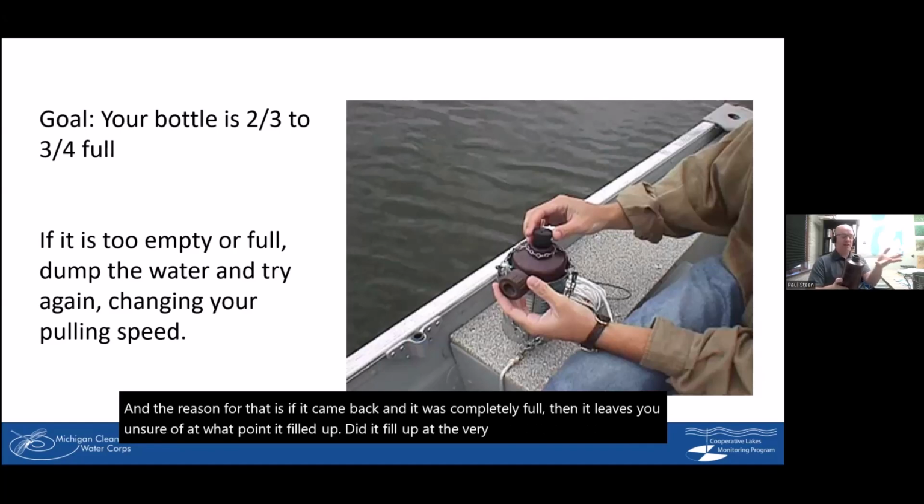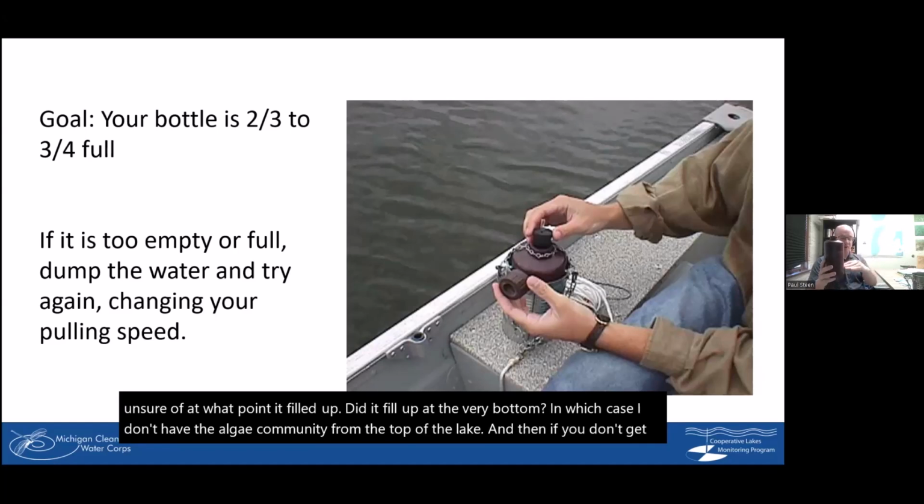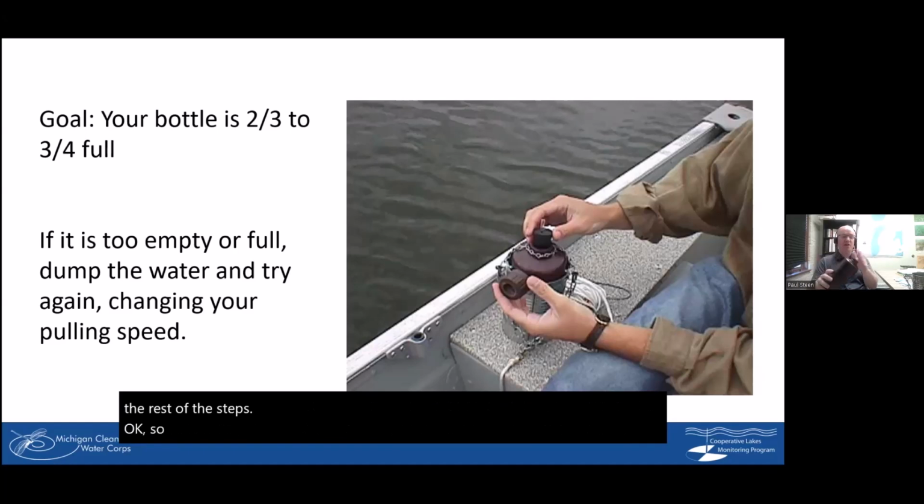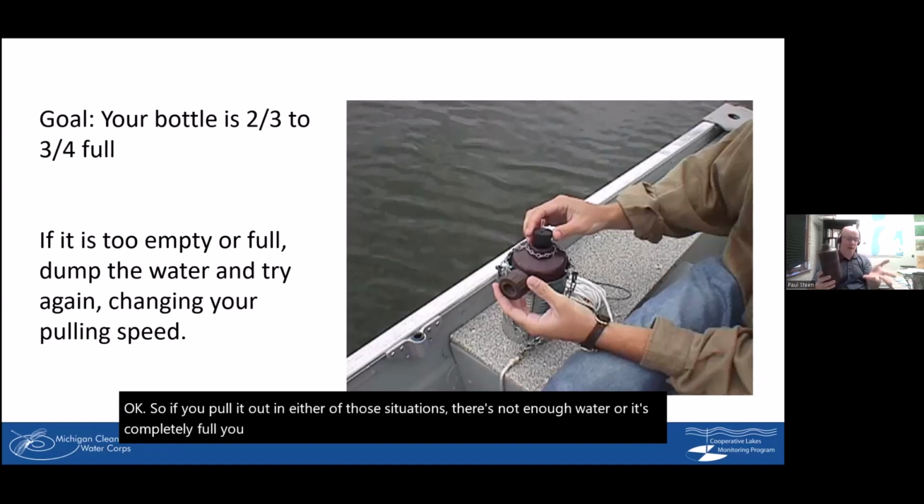In which case I don't have the algae community from the top of the lake. And if you don't get enough water, if it's too empty, you're not going to have the water you need to do the rest of the steps. So if you pull it out in either of those situations, there's not enough water or it's completely full, you have to redo that process.